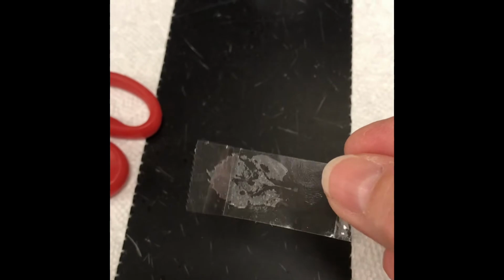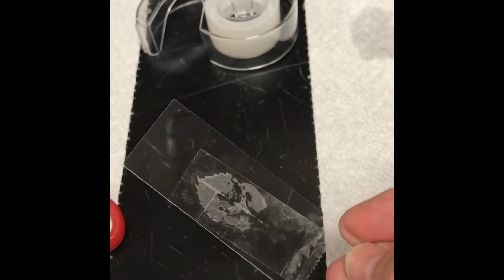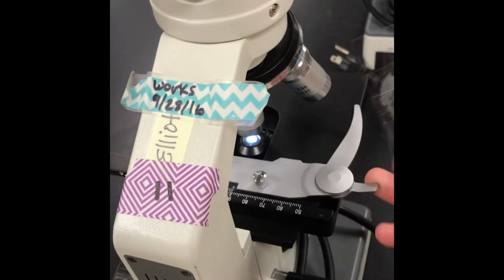Okay, so this is my tape. I pulled it off the first leaf, so it leaves an impression of fingernail polish, like this. We can make a dry mount by just sticking this onto our slide, like this. We stick it on, look at that, perfect little dry mount. And then we take this slide and we put it underneath a microscope so that we can try to find the stomata.